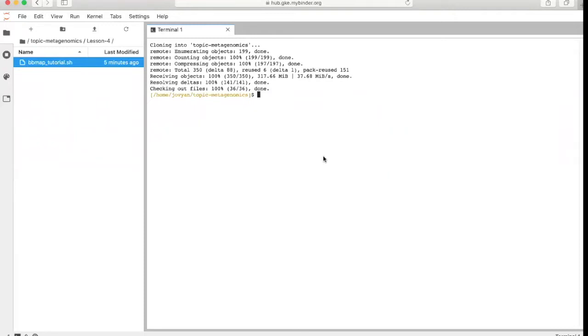The way this score is calculated within BBMap is a little bit non-trivial. So you can decide what kind of threshold you want to use to pick whether or not a read maps to a certain area in the genome. But the ratio is a little hard to calculate because it really is a measure of what's the score the read got versus what is the best score that it could have gotten if it was 100% matching to that area in the genome. This parameter where the ratio is called min ratio.